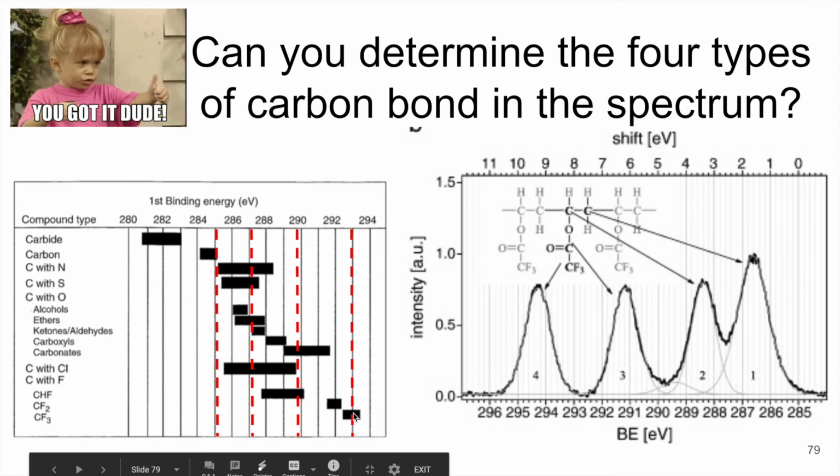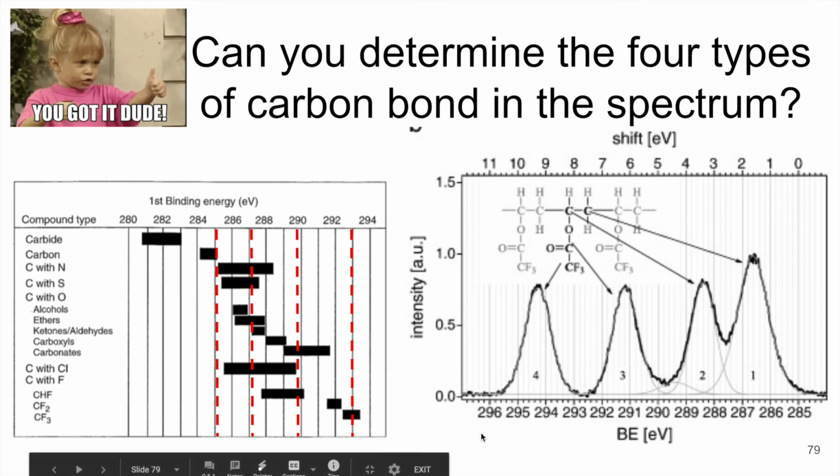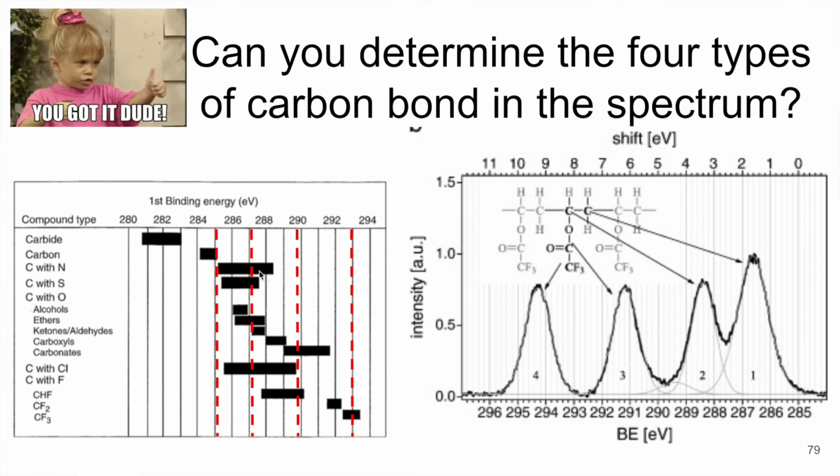So obviously, you're dealing with a kind of range here. Oftentimes you'll find more specific values in a database like this, but these just give you some ideas. And you can see that if our calibration isn't correct, if our position for carbon wasn't correct, then everything else would obviously be shifted. So it's important to make sure we have the proper calibration. I wasn't expecting too much for this middle one where you've got a lot of different options. As you can imagine, you're not going to be able to just say which one of these is purely by the number, because there's a lot of different options.